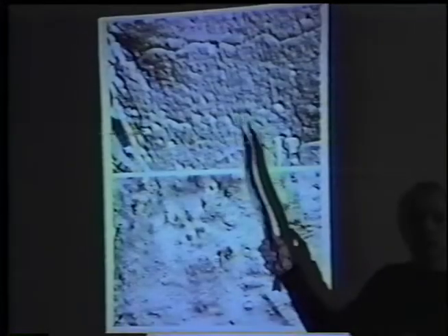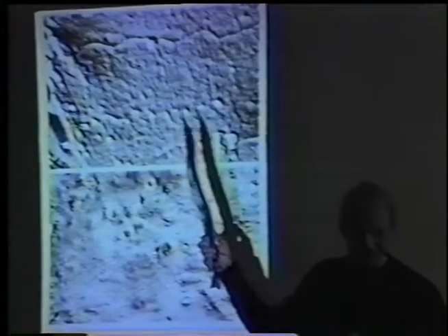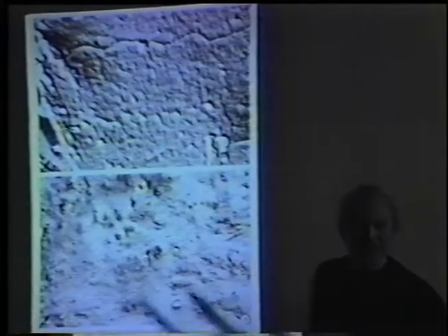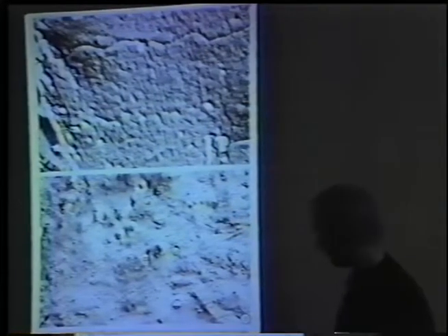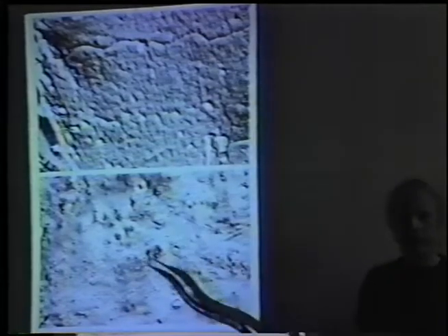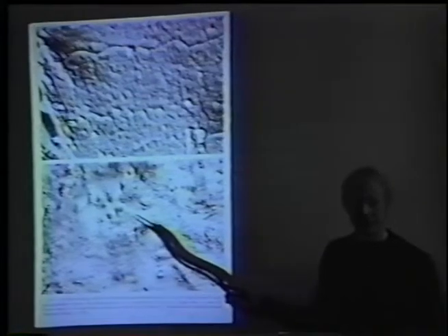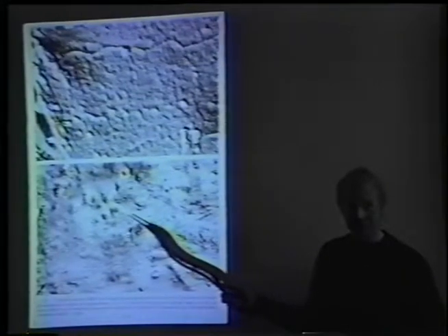Now, the freezing was not optimal, and as I recall, they were hand dipping. But this just points out that glutaraldehyde can cause these sorts of events in systems where they don't normally occur.